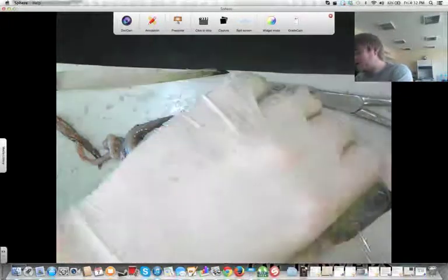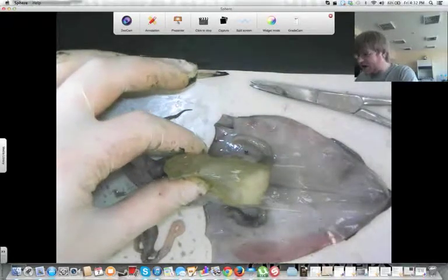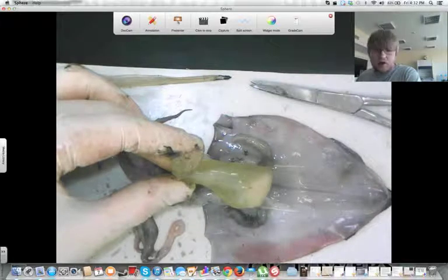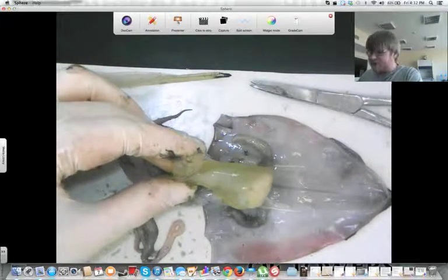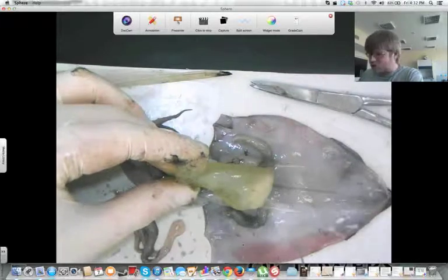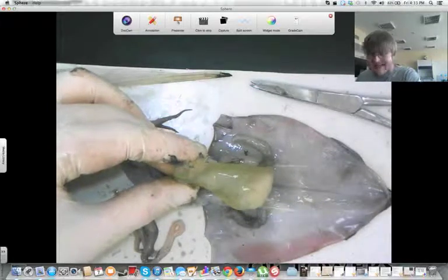Now, judging by the size of this caecum, I'd say this is a fairly immature squid, hasn't probably hit puberty yet. The other reason I say that is it's difficult to see the gonads on the other side. Now, I expect there's a bit of a whitish area here. This is a male squid. This is where the sex cells are going to develop and the squid is going to produce its sperm. In a female squid, you'll see the ovaries roughly about here, and there'll be sort of an orangish sac. It'll look a little bit like eggs.